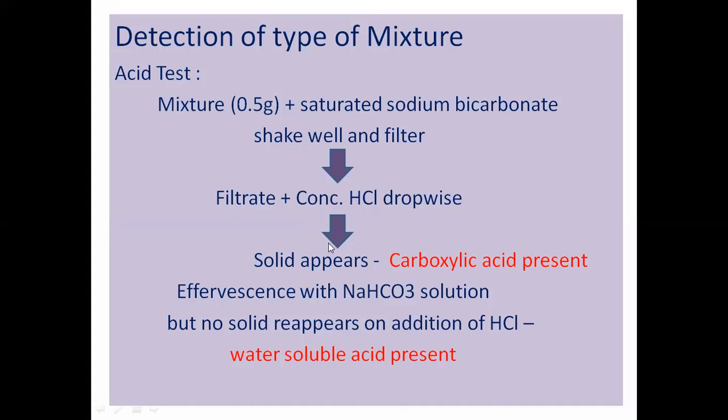See, now I will tell you. First, we have done the water solubility test. In the water solubility test, if after evaporating the water you get the precipitate, then you will know that one of your compounds is water soluble. But you don't know whether it is acid, base, or neutral. You only know the water soluble compound is present.